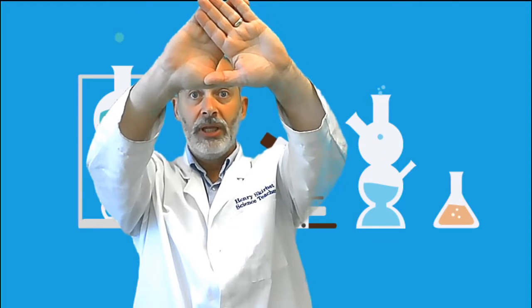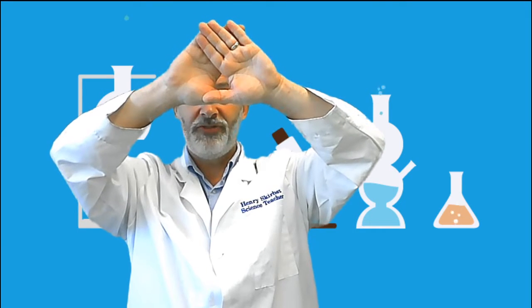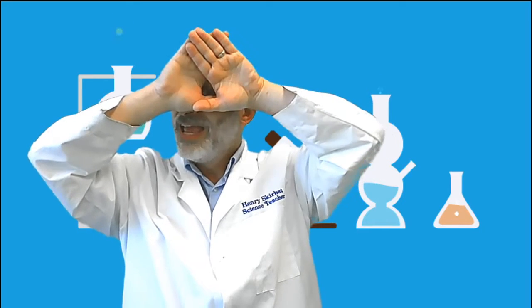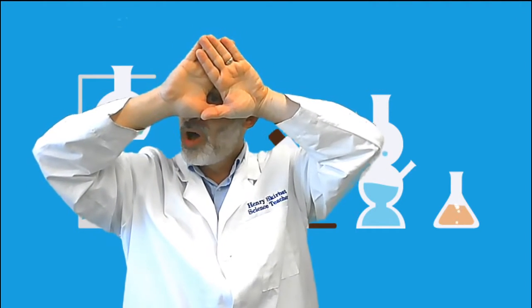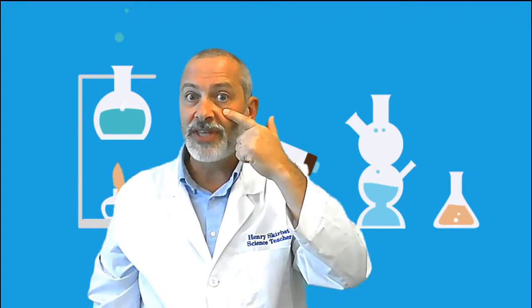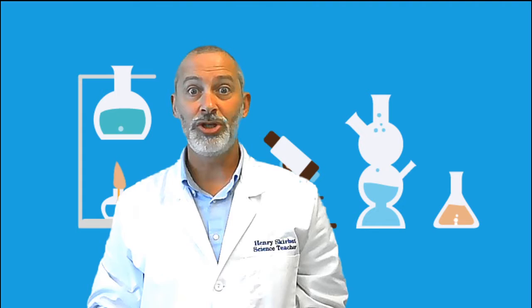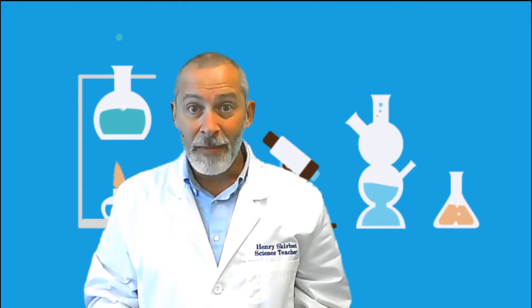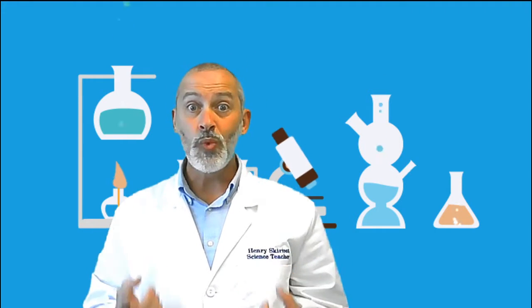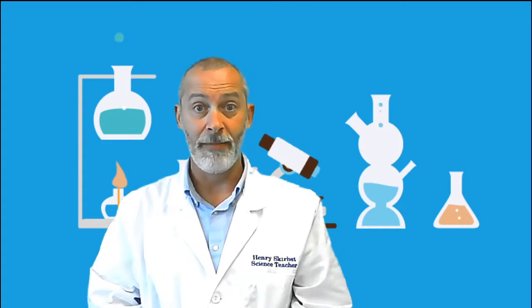Then slowly move your hands closer to your face, keeping the clock in the middle of the triangle, and that triangle will go back to one of your eyeballs. In my case, it goes back to my left eye because my left eye is dominant. If your triangle came back to your right eye, it's because your right eye is dominant. One of your eyes is slightly stronger than the other, and that's the one that you're going to use to look through a microscope or other device like a telescope for that matter.